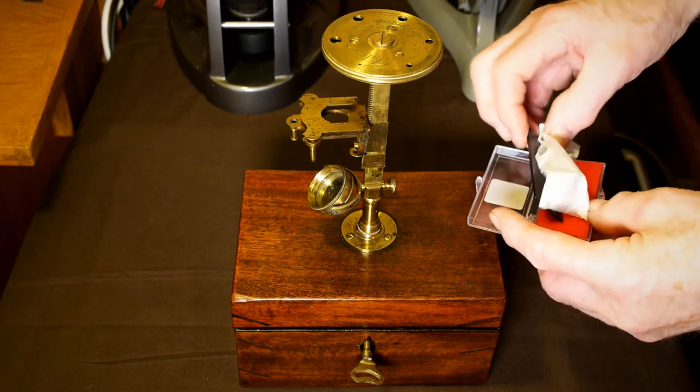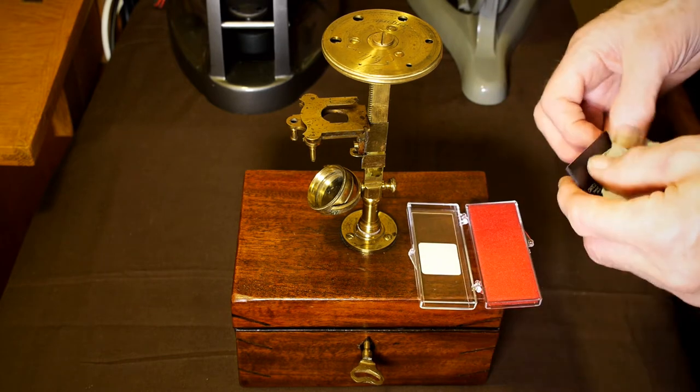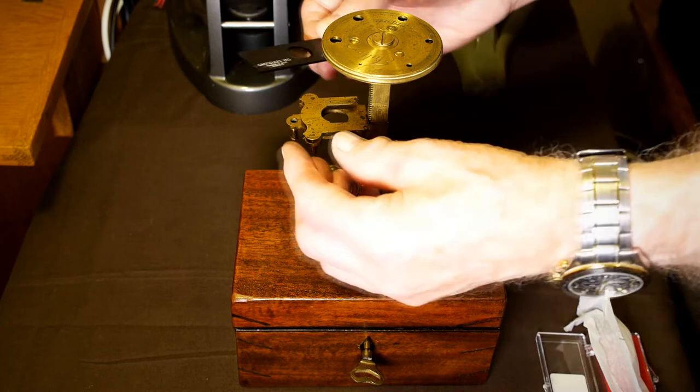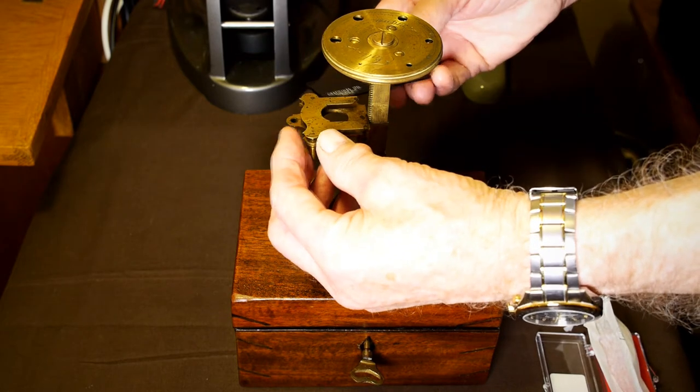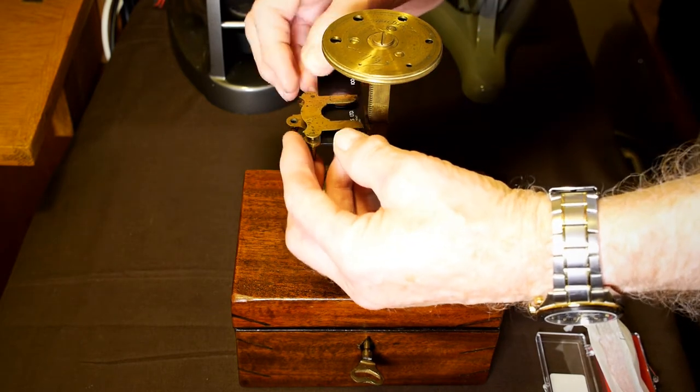We'll use a modern stage graticule marked with 100 divisions each 10 microns apart to enable us to gauge the quality and resolution of the simple lenses used in this particular microscope.